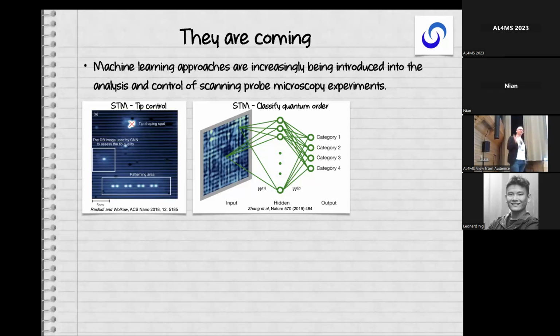They couldn't find anything useful, and ran it through a pattern recognition technique using deep learning, and were able to find different signatures of quantum order in these images of oxide materials. So I think this is a very tantalizing idea of turning bad old experimental unpublished data into really high impact, high level science. So don't ever throw anything away.